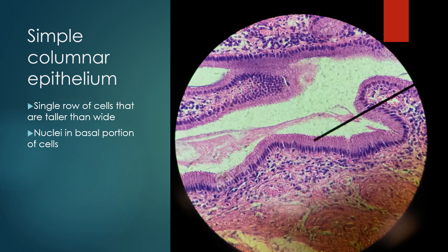Number nine was simple columnar epithelium. I had the pointer on this line of cells here. These cells are taller than they are wide, so they're quite tall. Each of these dark purple blotches is a single nucleus, and you can see that the nuclei are in the basal portion, close to the basement membrane. They're pretty much lined up with one another. It's really apparent here that you don't have layering of the cells. A single layer of those tall epithelial cells—that's your indication that you're looking at simple columnar epithelial tissue.